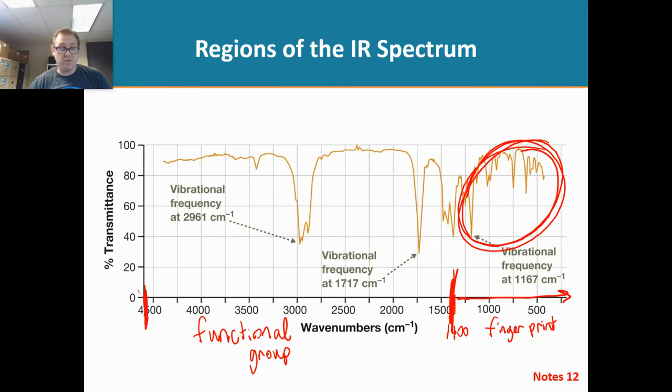So in the functional group region, look at that name. It is identifying functional groups.